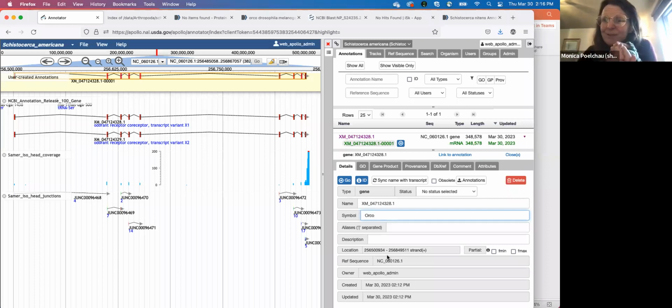One is I don't QC the structural changes. There's really no good way for me to do that. I have to take your word for it that those changes are legit, in terms of this is a new exon in the protein. But I do review your name changes, and this is why I'm going into a lot of detail with those as well, because that's where a lot of the pain happens. But I'm going to give you some guidelines to hopefully make it pretty straightforward for y'all.